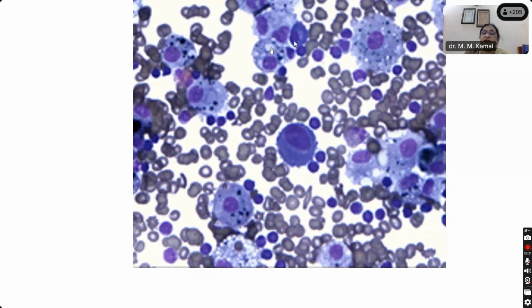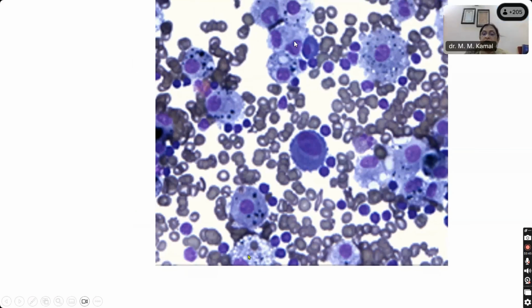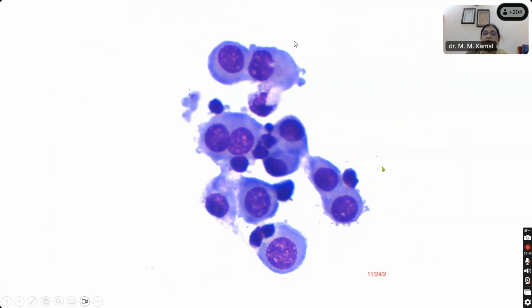Now, in these histiocytes, what are these inside the histiocyte? Vacuolated cytoplasm, and engulfed nuclear debris. Here you can see a very nice foamy cytoplasm. Now, what are these cells? Again, very easy to diagnose: sheets of mesothelial cells which are enlarged and with an eccentric nucleus. Eccentric or centric? Okay. Yes, all the features of mesothelial cells: blebs, microvilli, two-tone cytoplasm, windows in between the cells, and a slightly clasping type of arrangement, which we will see better in the coming pictures.